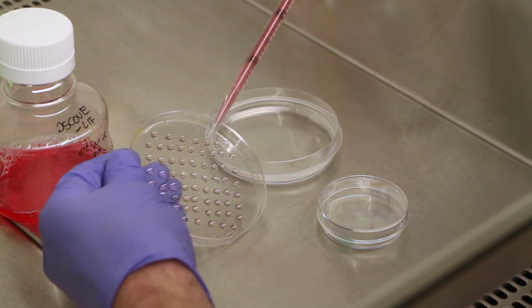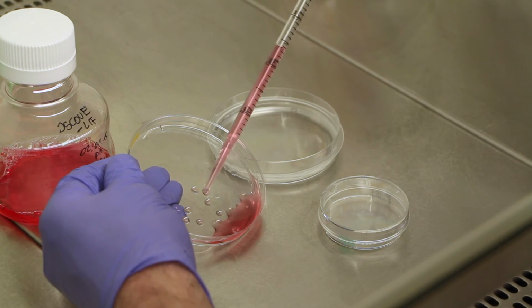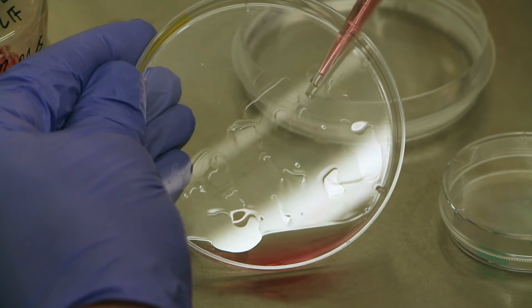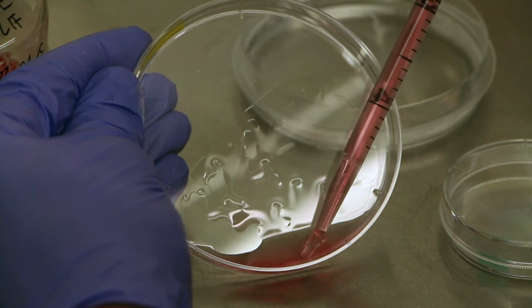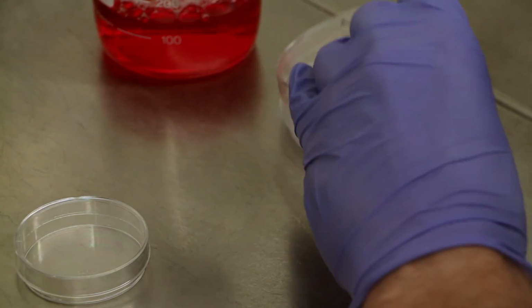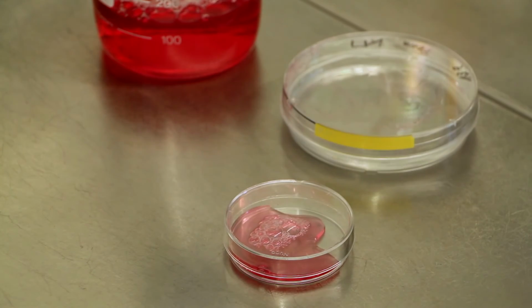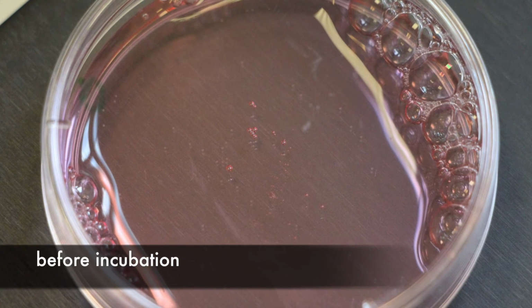With 5 ml test medium, the embryoid bodies are rinsed off the lids. It should be ensured that no embryoid bodies are left behind. They are transferred into bacteriological petri dishes and incubated in these for 72 hours. During this time, the embryoid bodies grow and significantly increase in size.